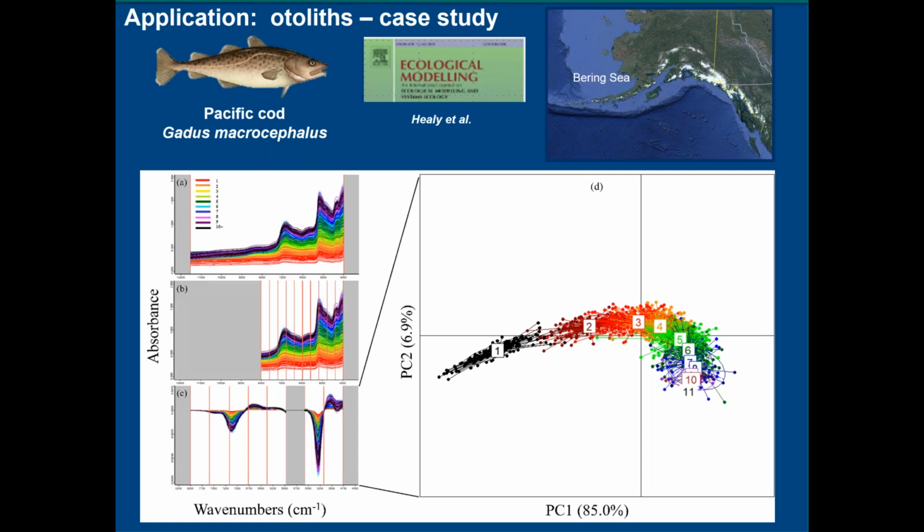Okay, sounds good. And that leads partly into the next question. I'm going to probably pair these two questions up. The first one is from Andrew Chin, and it is asking whether you have tested vaterite otoliths. And then the second one is kind of related on the topics of logistics with otoliths that you're testing, and comes from Dana Rudy. And it is, does glycerin interfere with FT-NIRS reading? How about the curvature of the otolith? Are there any deal breakers for using the FT-NIRS technique or species that you've run into trouble with? I'll start with the last question first.